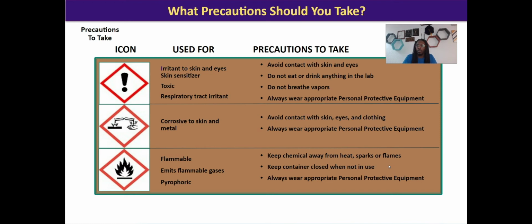Keep the container closed. If you're not using this container, really for all chemicals, you need to close the cap, close the container, right? Always keep it closed. And of course, you need to wear your proper PPE, personal protective equipment.